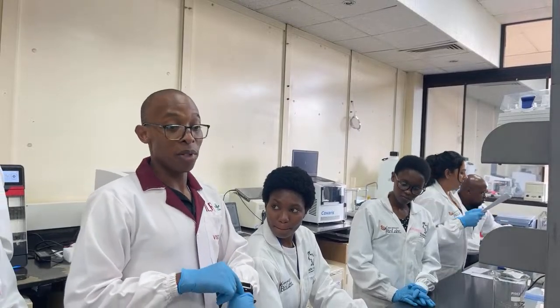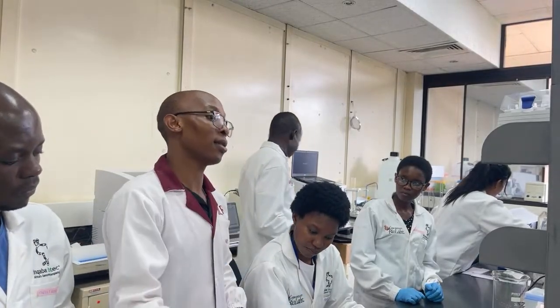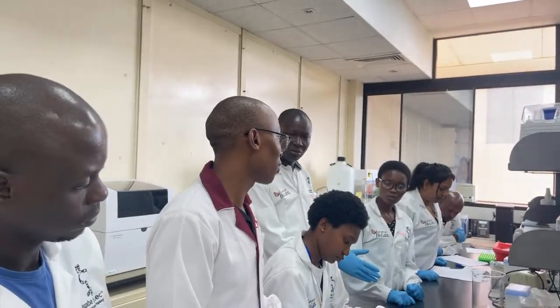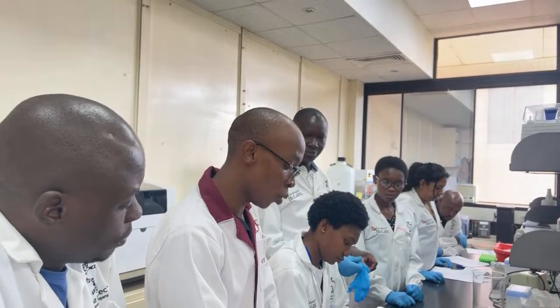We still need to wait. We still need to incubate for another 30 minutes, and then leave it overnight. Otherwise we won't finish, because the minimum is 30 minutes. We went for 2 hours, so we'll see at the end how it works. But we should have something.